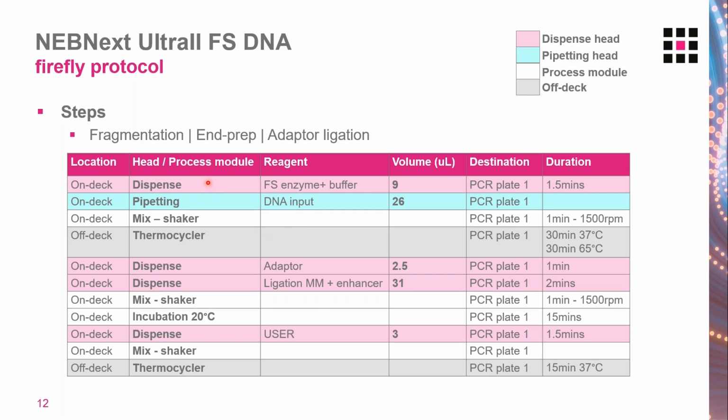We're using the dispense head for the bulk additions, bulk additions of the USER, the adapter, and enzyme mixes. These are additions to all wells of the plate. I've indicated the time it takes to fill the whole plate with this reagent, from the dispenser to the first well to the last well of that plate. It's typically about a minute. If we're using a slightly larger volume, the time of this dispense increases a little bit.